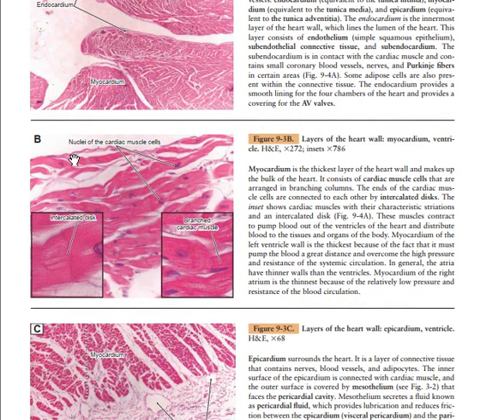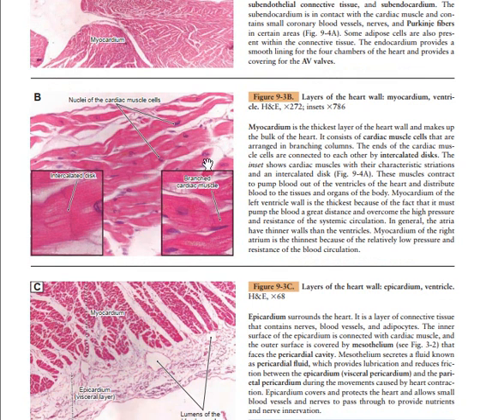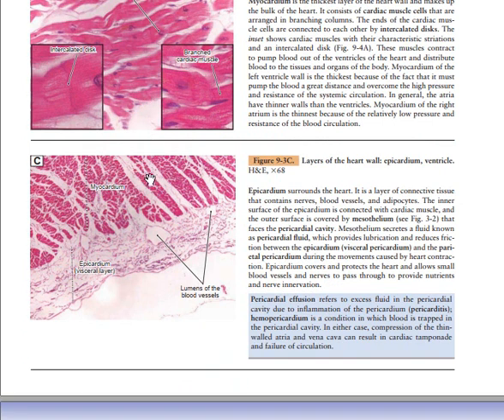Now, generally, this is the myocardium. For the myocardium, you can visualize here the cardiac cells. The cardiac cells are being seen with their intercalated discs, and the characteristics of the cardiac cells is that they are branched, as you can see here, and they have one nucleus, with the intercalated discs which connect the different heart cells together. Now you can also visualize here the connective tissues, and the wide cells located in the connective tissues here are the fibroblast cells.